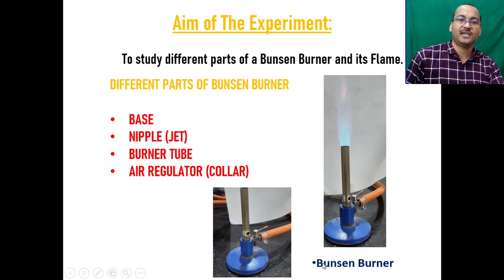You can see here a nice Bunsen burner — this is the way it looks. And if you connect it to the gas and put a match or lighter on, you will get a flame like this.